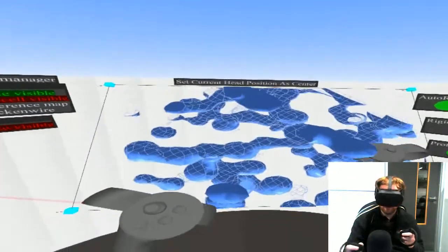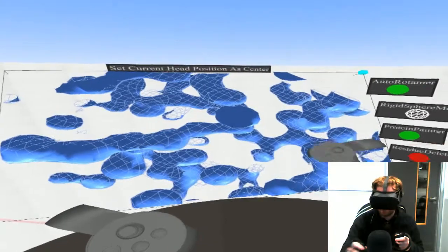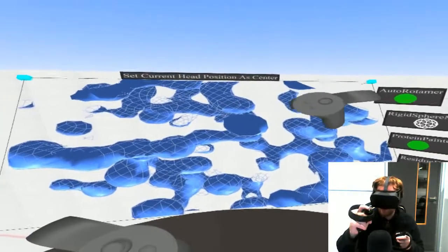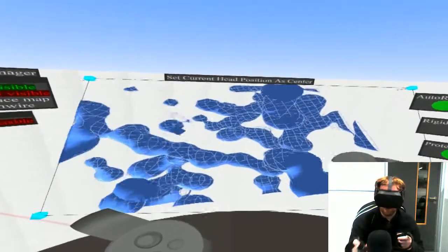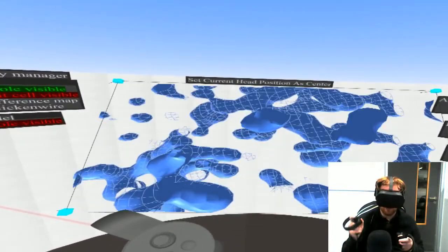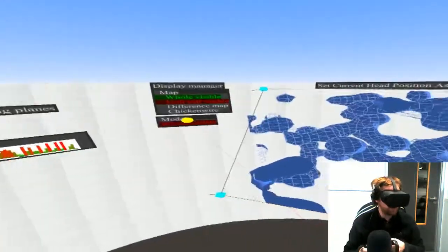And you might notice that I can move my hand around inside of this. But if I grab with my middle finger, then now I'm moving it towards me, away from it. I can do whatever I like.